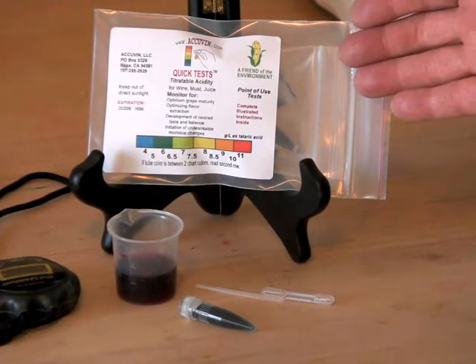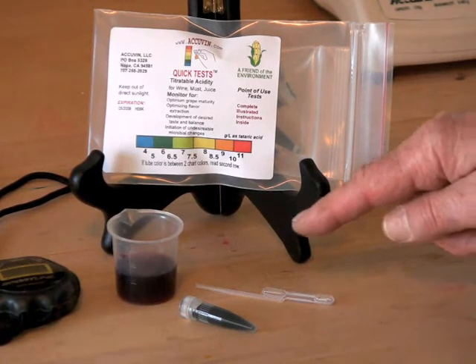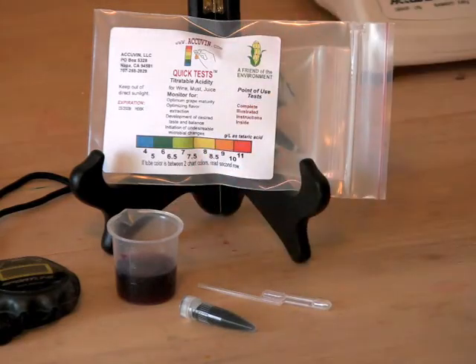This is an Accuvin titratable acidity test kit. To run a TA test, you'll need a sampler, a reagent tube, and a sample of wine.